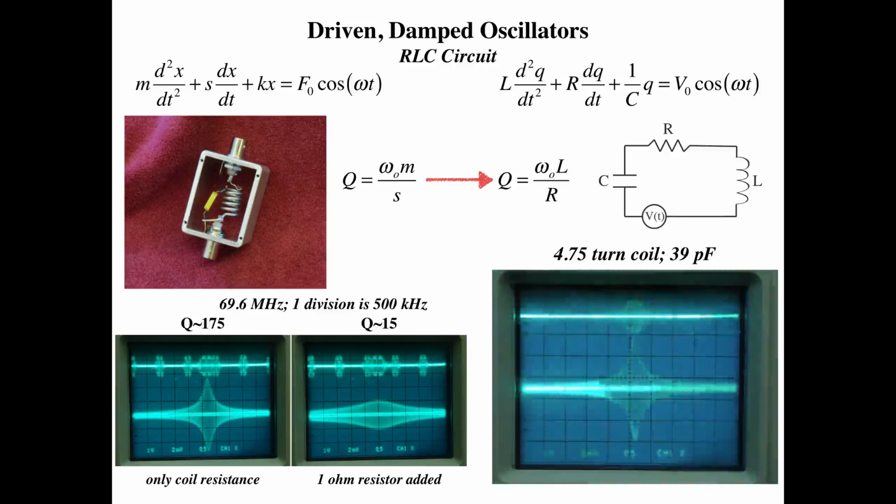So let's see how this relates to the resonance circuits that we've discussed. Here we have a capacitor, resistor, inductor series circuit with a driving source located in the circuit. If you look at the voltage equation for this circuit, there's the source voltage, again with a frequency term omega, and here are the voltage drops across the various elements. Normally you think of the voltage as equal to IR for a resistor, but instead of using I for current, we use dQ/dt. In other words, current is dQ/dt, where Q is charge.